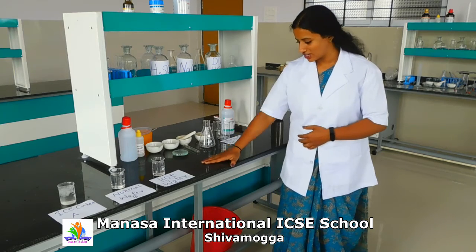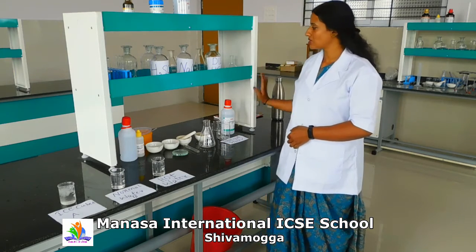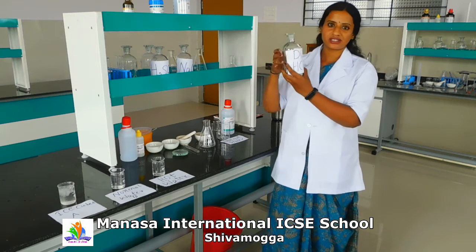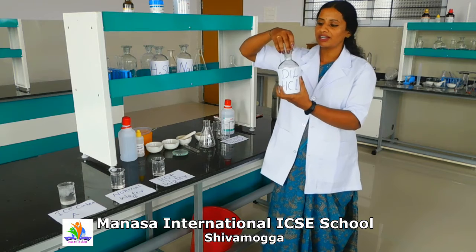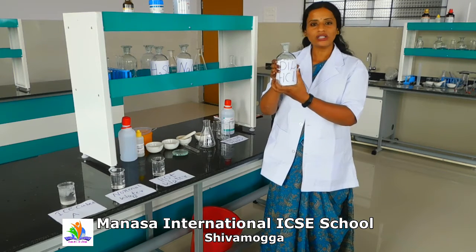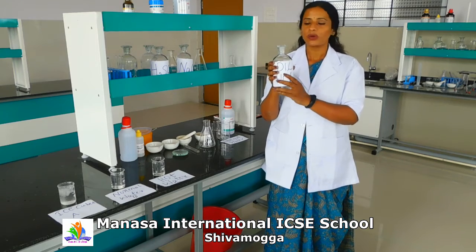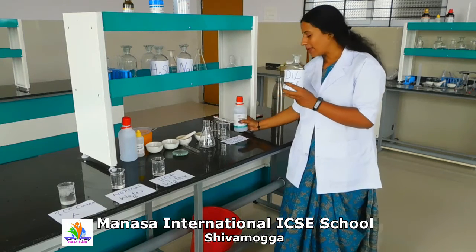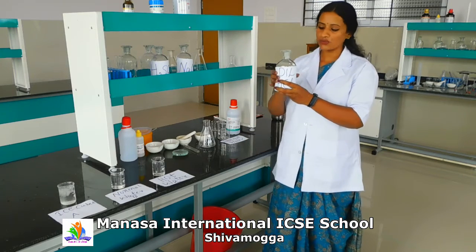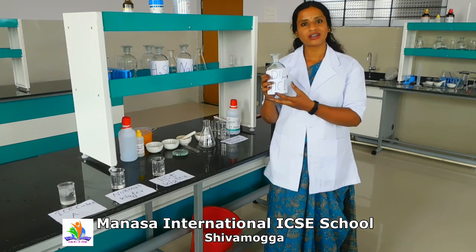So this is the table where we have arranged the reagent shelves. This is called the reagent shelf, and these are called the reagent bottles. It has a lid which can be opened and closed, and all the solutions, whether acids or bases, which are bought from the market, will be stored in the reagent bottles and labeled, because most of the chemicals are colorless.